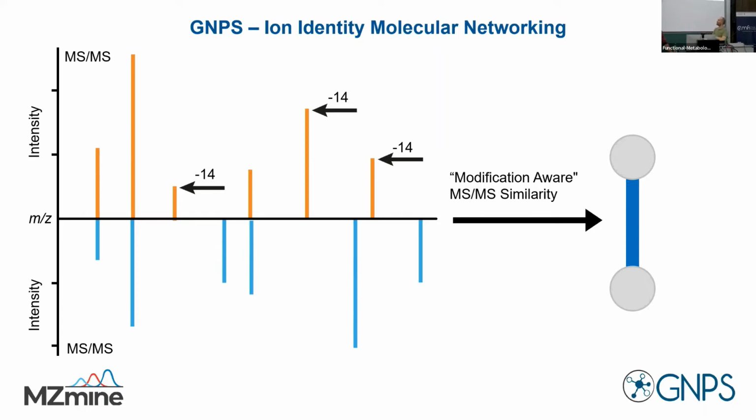But you define, first of all, the cutoff of the similarity score, by what value nodes are connected. By default, this was 0.7, but you can of course increase or decrease that. Then you will get either more stringent networks, or very loose ones with more false positive connections. There's another very important setting hidden under the advanced tab. I'll show you later how to get quickly back to the settings and change those for new jobs. There's a maximum connected component size, where you define the maximum number of edges that one node can have, and I think by default that is 10, right?